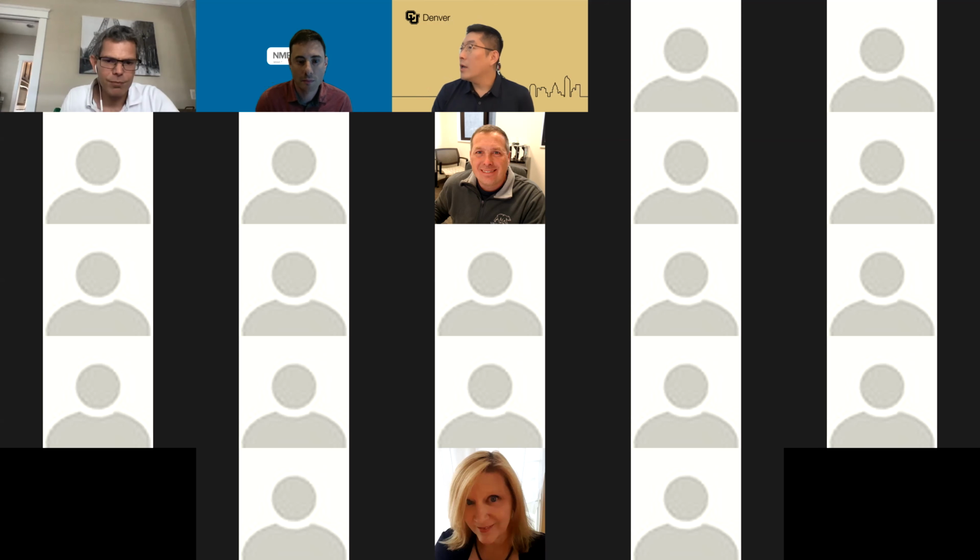Okay, thank you. Any other questions? Can I just ask about, have you done any cross-validation? Because you showed these structures, the quality of the structures improved. But I'm just wondering if you've cross-validated that with some data which you haven't used in the calculation. Yes. We did a lot of cross-validations in very different forms, also for our older tests.